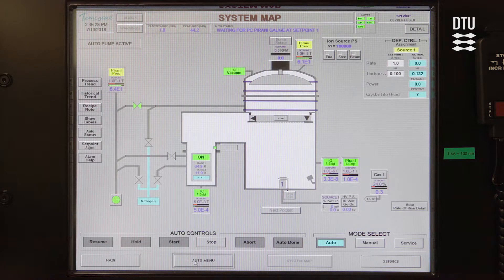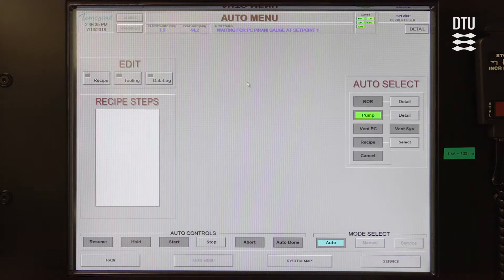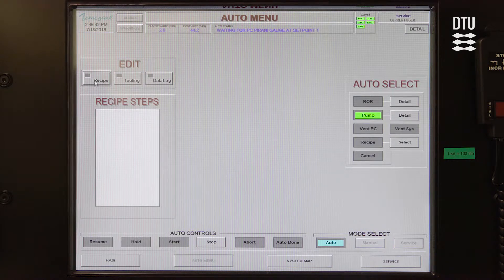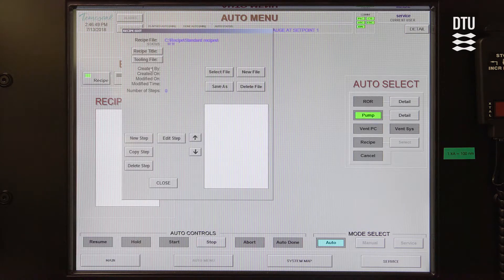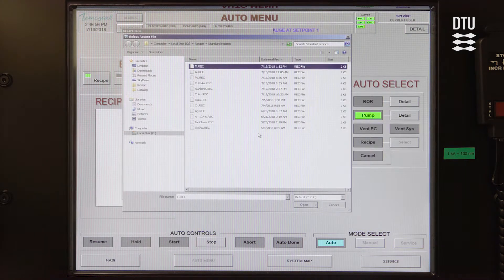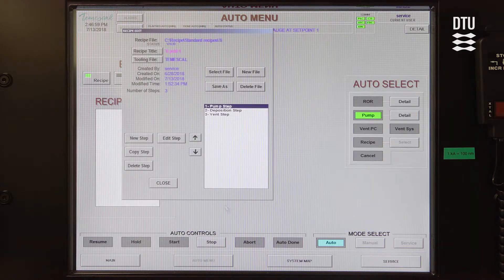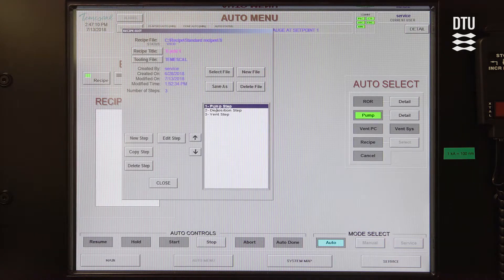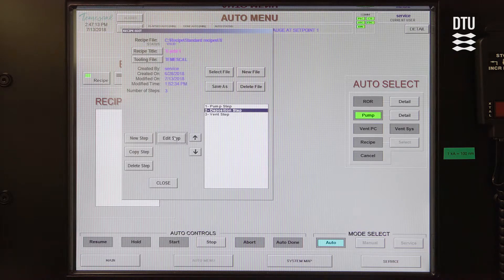While the system is pumping down, you can go into the auto menu and edit the recipe to make sure you get the right thickness and the right material. You go to the left part of the auto menu and choose Edit Recipe. You need to select the file you want to edit — I'll select Titanium and press Open. You will see the recipe title says Titanium Pocket 1, but you should always go in and check that it's actually the right pocket. Go into the deposition step, highlight it, and then go to Edit Step.